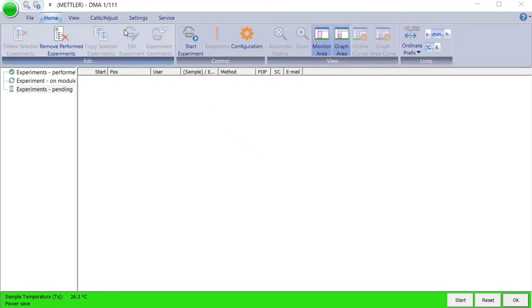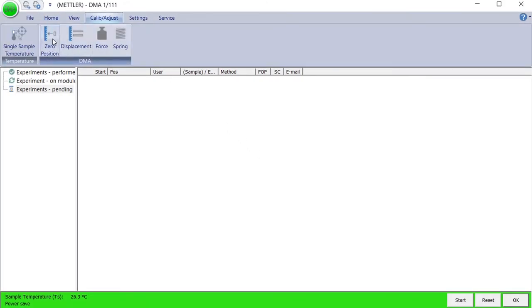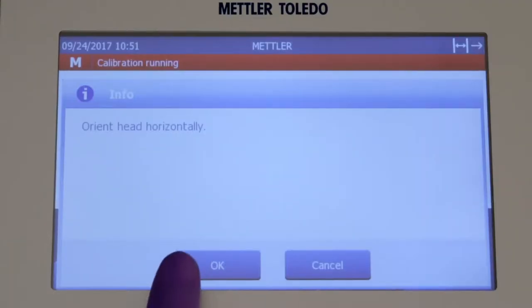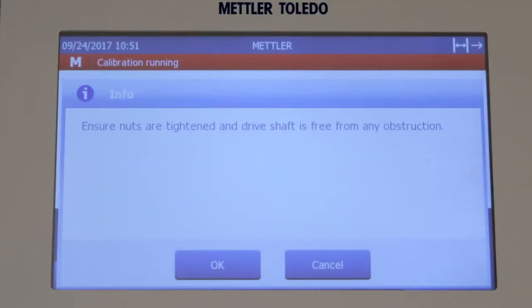In the module control window of the software, start the adjustment by clicking Zero Position Adjustment on the Calibration Adjust menu. Click Yes and follow the instructions on the DMA1 display. Tap OK for the instruction info.